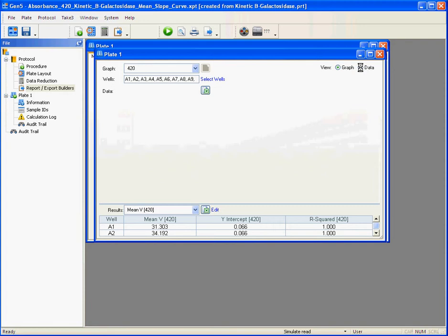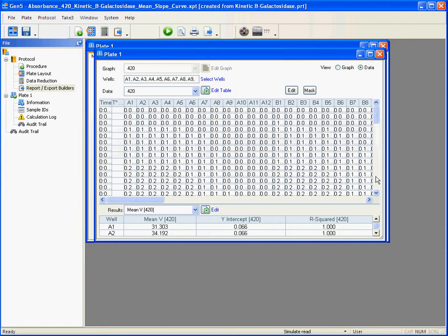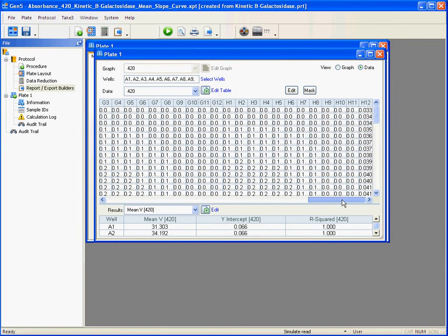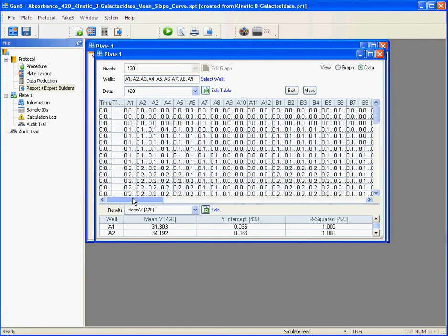You can also look at the data as a large table that shows you all of the results and export all of this data in one click using Gen5's quick export function.